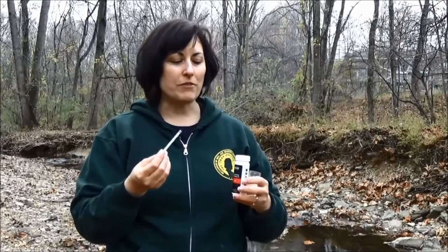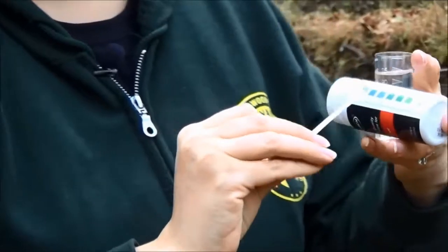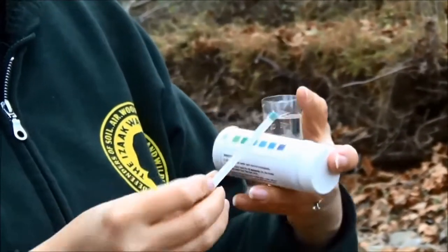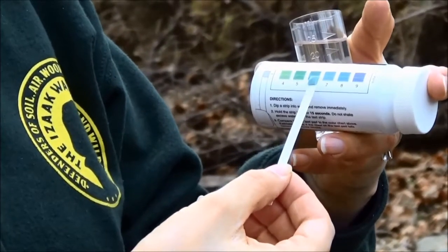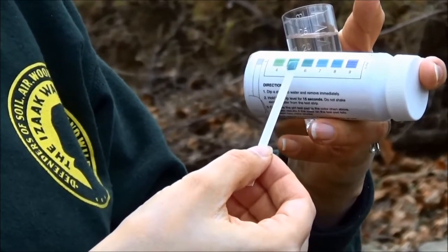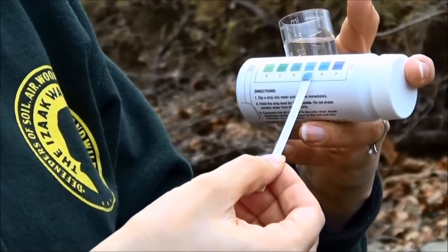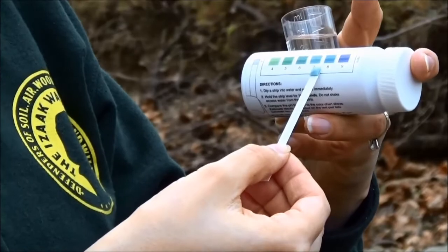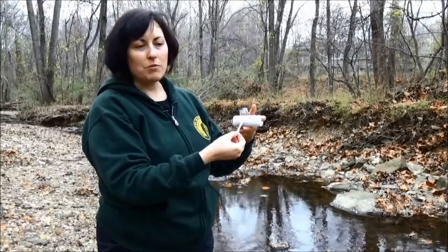We're also going to measure the pH of the stream. With another clean sample of stream water we're going to dip in our test strip and time it for 15 seconds, then read the color change on the bottle for our pH. This is a measure of how acidic or basic the water is. It looks like a 7, which is perfect — 7 is neutral. pH goes from a 0 to 14 scale with 7 in the middle, and that is exactly what you want for most stream life.